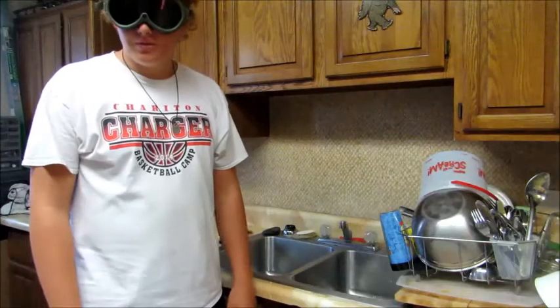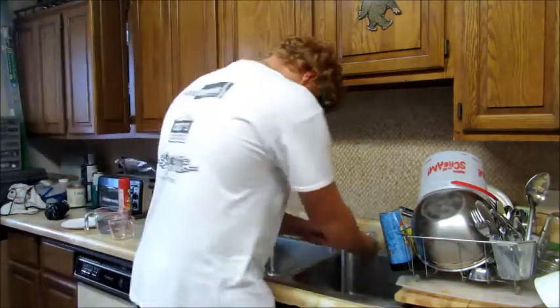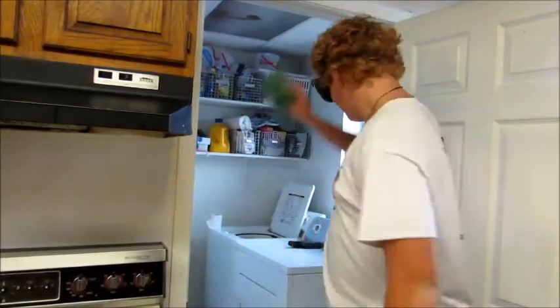Keep your hands away from your face and mouth while in the laboratory, and always wash your hands before leaving. Hey, oh, class is over. Time to go. Remove contaminated clothes immediately, and wash them separately. Oh, there's something on my shirt. Oh well.